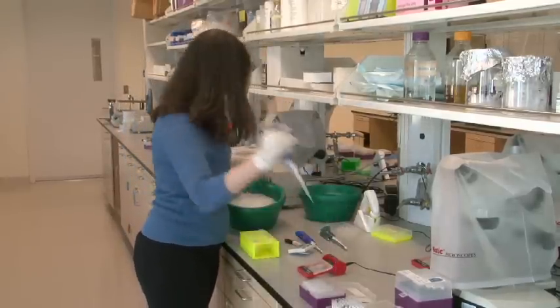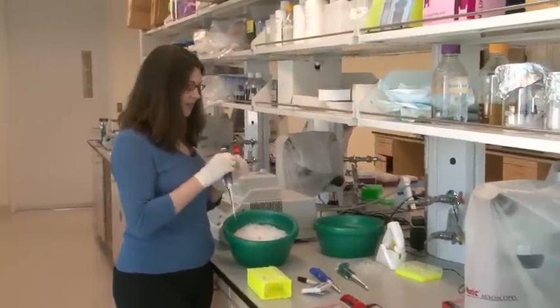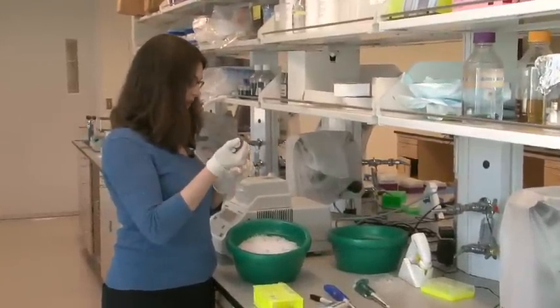Each time I pipette a different sample, I use a different pipette tip so that none of the samples are contaminated with each other.